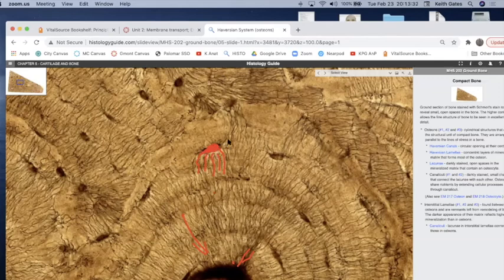this is a jellyfish, right? That's the body. The tentacles are the canaliculi, the squiggly lines there. So that's this tissue. And the other one is almost exactly the same. It's just a slightly different color.